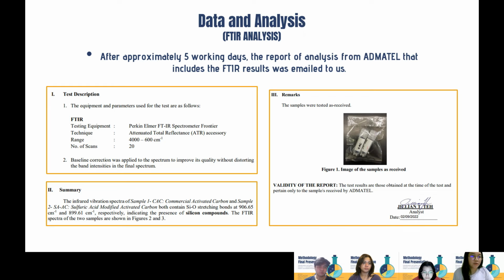The last part of our presentation includes the data and analysis. As mentioned, two testings were done, FTIR analysis and UV-vis spectrophotometry. After submitting the samples, we received the FTIR results after approximately 5 days. We received the requested soft copy of the report of analysis from Admatel via email. The report includes the test description, summary of the results, remarks, and lastly, the FTIR spectrum of each sample.